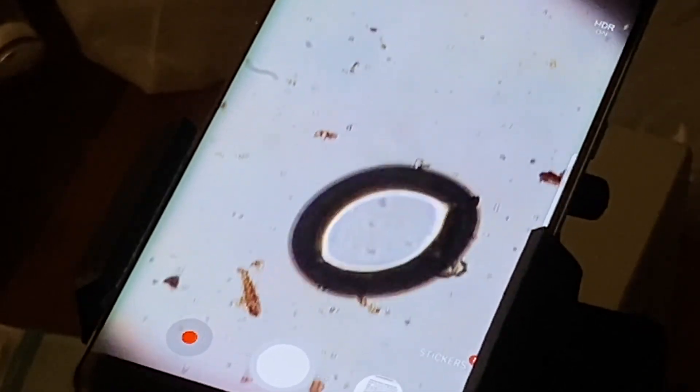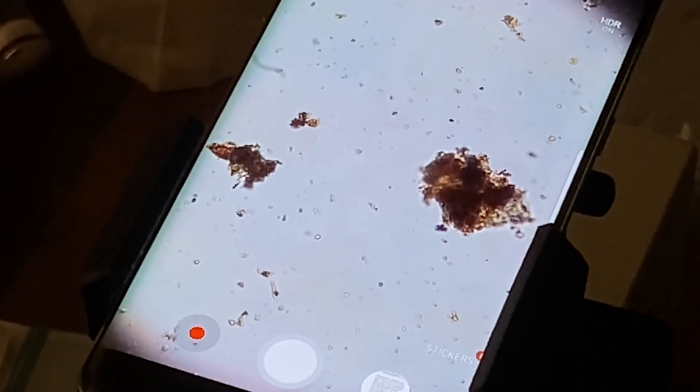More minerals. These brown structures are humic acids. You can see all the different items attached to the outside — they'll bind to just about everything. They have a really long, complex chain structure at the molecular level, so things like to bind to them. This will help your soil aggregate, help it stick together without being like clay. It'll help make it more like a cake that sticks together. So we always want to see lots of humic acids, which we do.